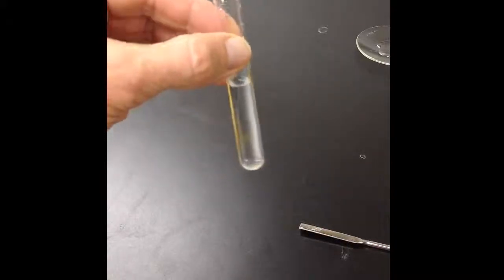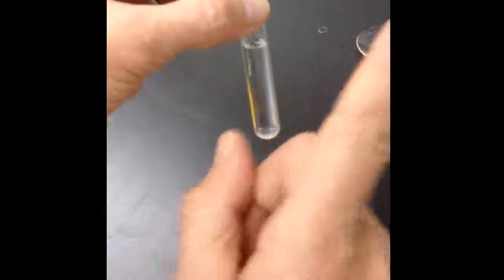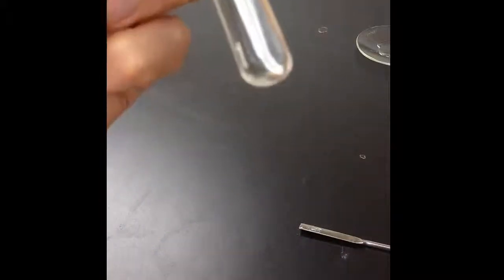Hold your finger at an angle. Allow the test tube to flop in your finger as you pass the angled finger past it. If you do it quickly and with just the right timing, you'll get it to swirl in the test tube, which will greatly aid in mixing and stirring, so that you can see whether or not this compound is soluble.